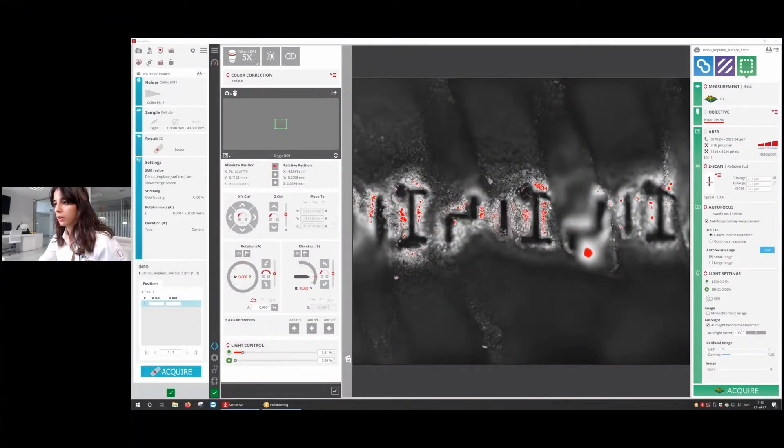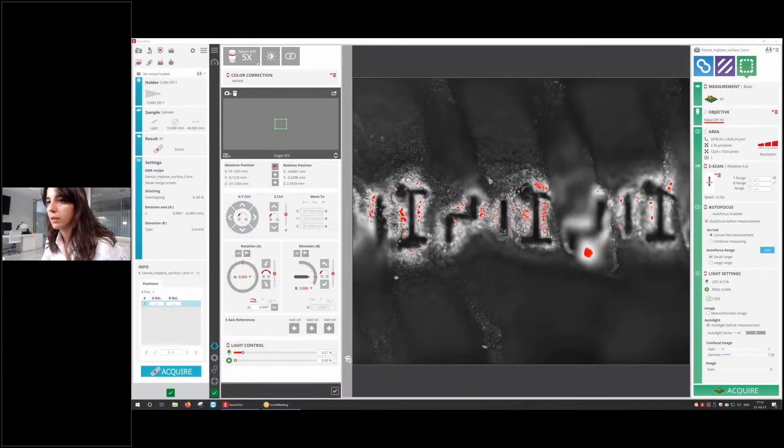To demonstrate these capabilities, I'm going to use a dental implant that is a type of sample that's going to benefit a lot from these new capabilities. Let me share my screen. Here you can see the dental implant.